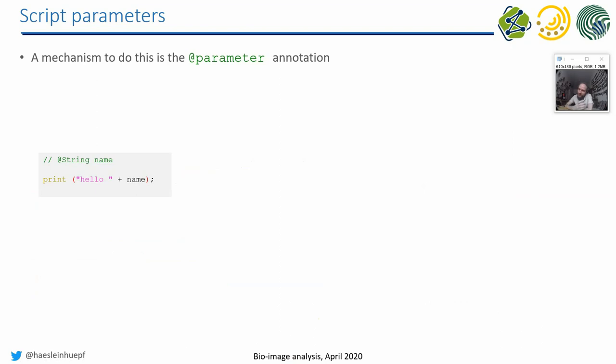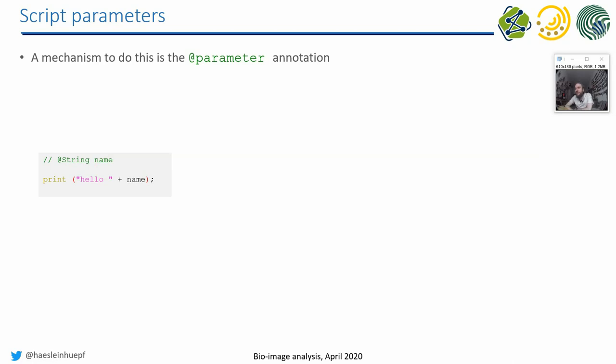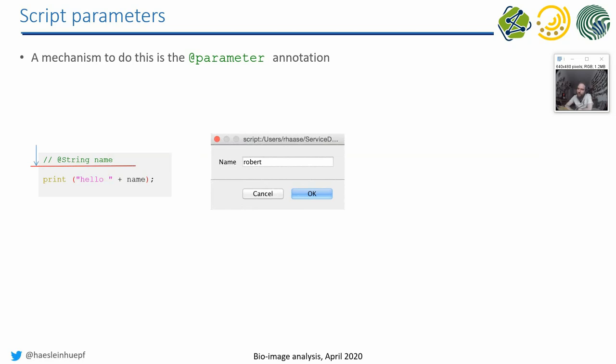An alternative to that, an alternative way of achieving the same thing, is using the so-called @parameter annotation. The special thing with the @parameter annotation is it only works at the beginning of your program. So you can enter a term like this, where you say, I want to have a string in a variable called name. So it's unfortunate that the order here is different, that it's not name equals something. It's something will be written into the variable name. Then, if I execute this little program, try it out later on. If I execute this little program, a dialog will pop up, where I can enter my name.